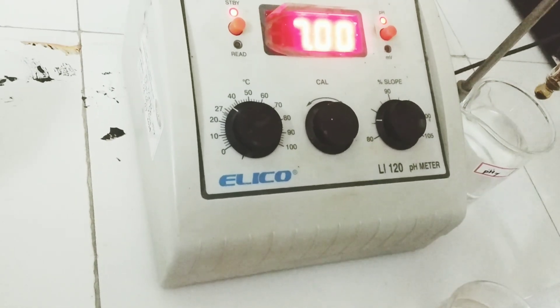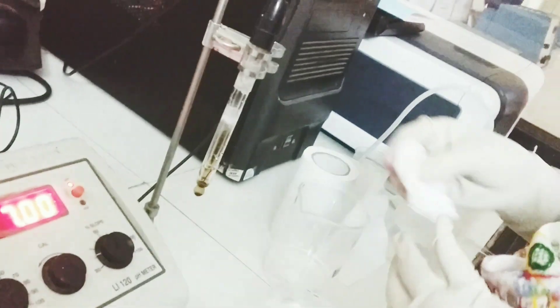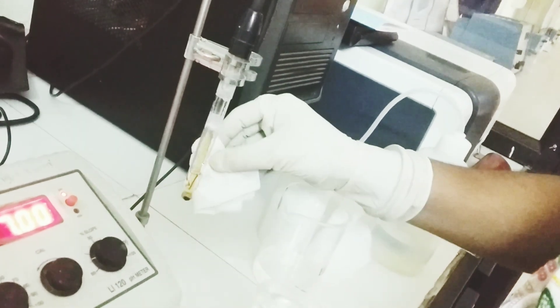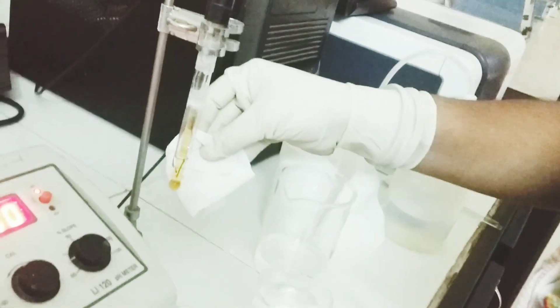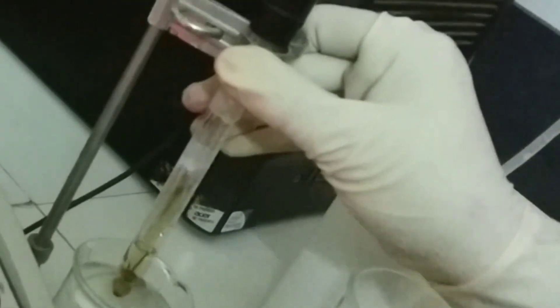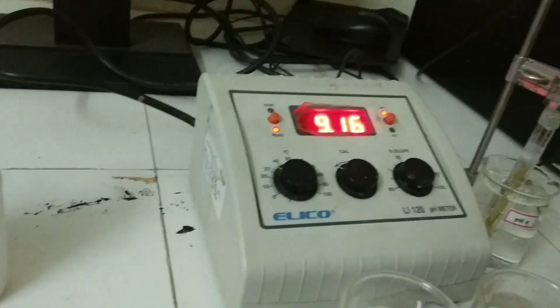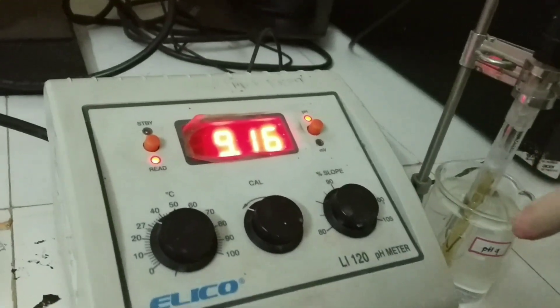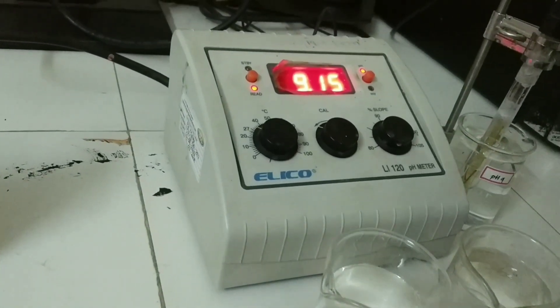Now removing the electrode from pH 7. As it was distilled water, there is no need to wash it again. Just cleaning the membrane and placing the electrode in pH 9 buffer. You can see it is showing 9.16. The buffer tablet pH range is also 9.18, so no further adjustment is needed and it can be left that way.